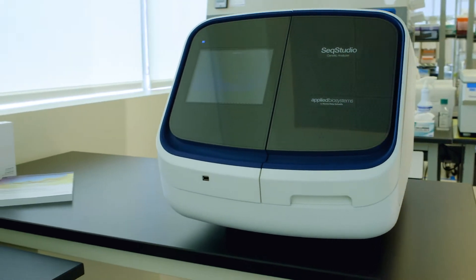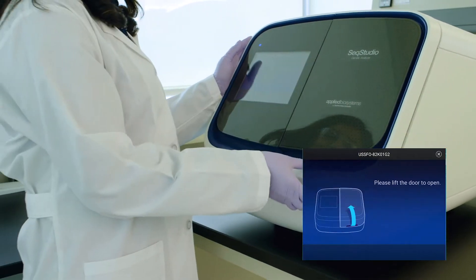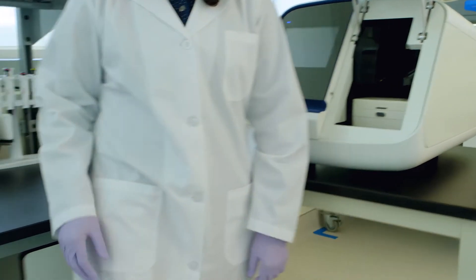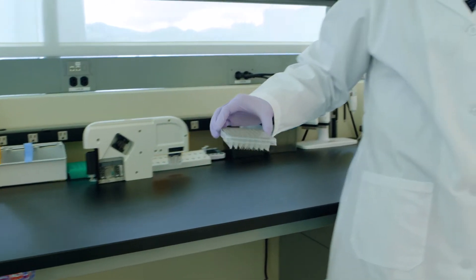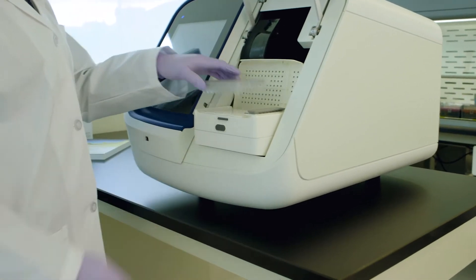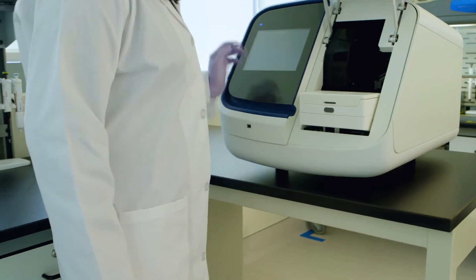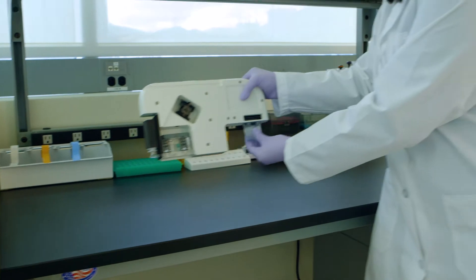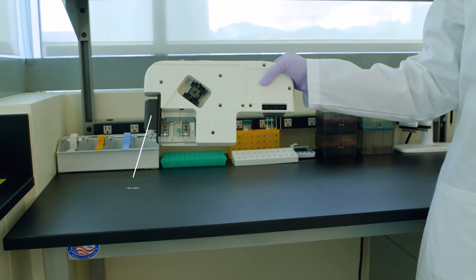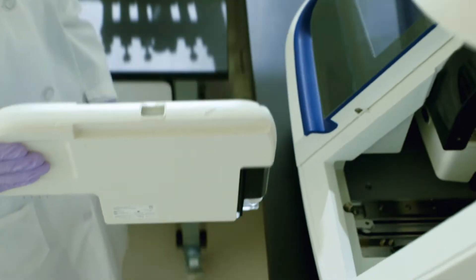This is the new Applied Biosystems SeqStudio Genetic Analyzer. Open the door — samples are prepared just like you're used to. Insert the sample plate, cathode buffer, and the cartridge. This includes everything you need: the capillaries, anode buffer, polymer delivery system, polymer, and the laser detection window.